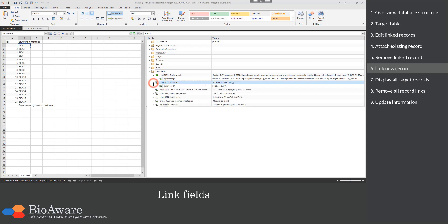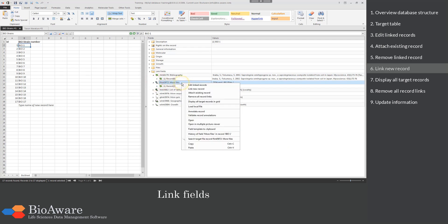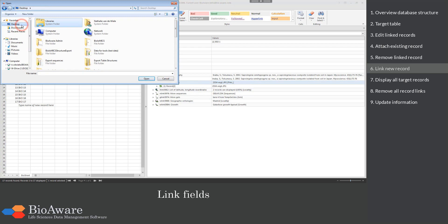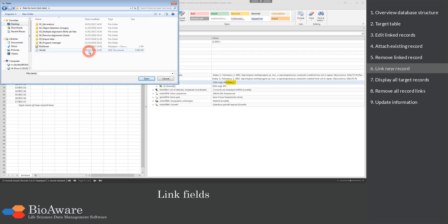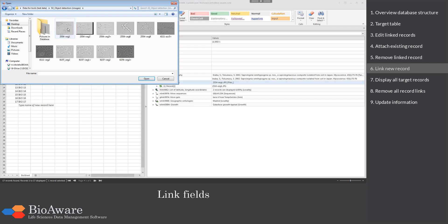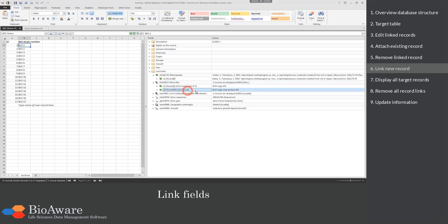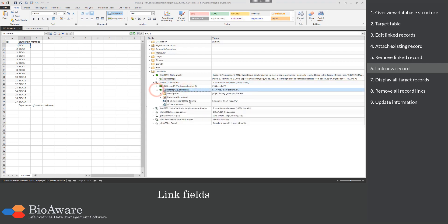It is also possible to link a new record or to attach an existing record directly. Right-click on the field and choose Link new record. Because we are going to link a new record to the files table, it will ask you to choose a file you want to upload. Then you have to give the name of the new record which will be created in the target table — in this case the files table. Now the new record is created and as you can see, the file is there.